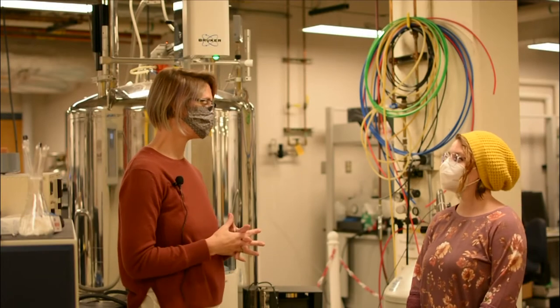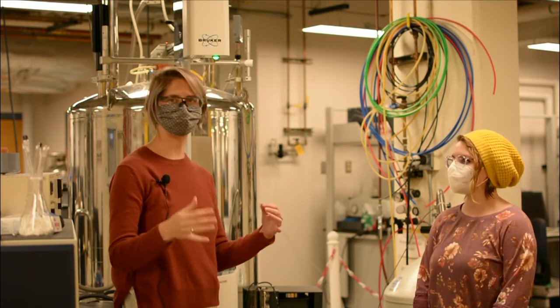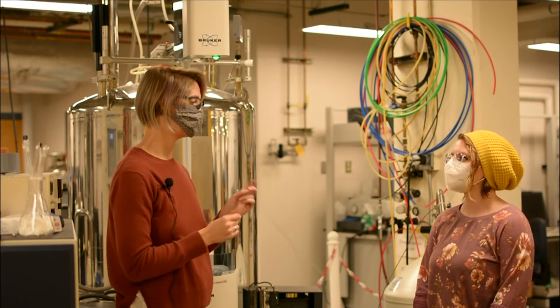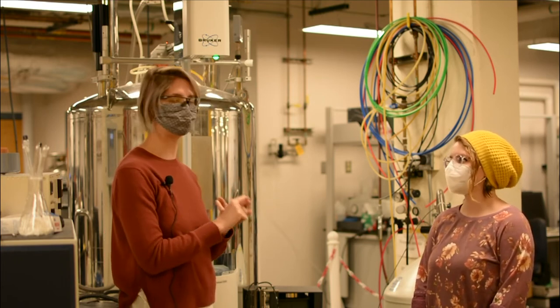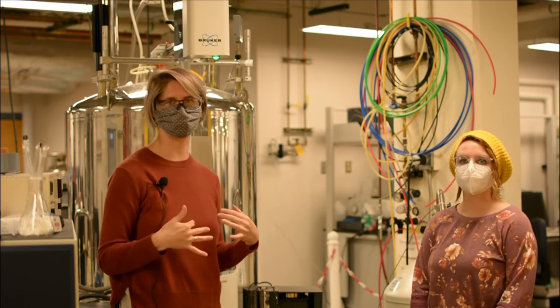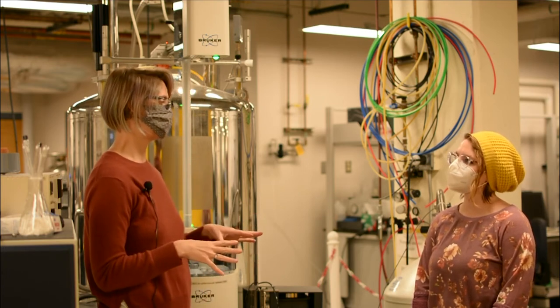Now that we've checked that we don't have anything magnetic on our body, we can enter the magnetic field. Also remember your phone, your wallet, your keys — in addition to your watch — are things that should be left on the console table before you enter the magnetic field.